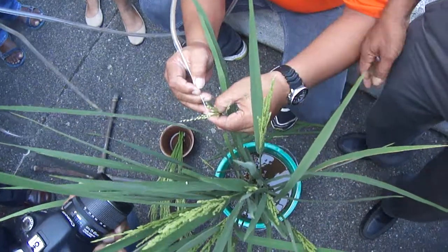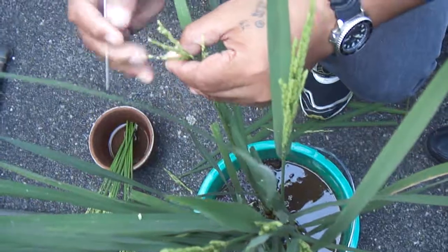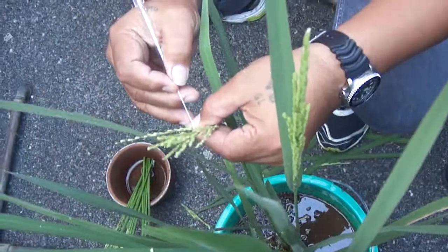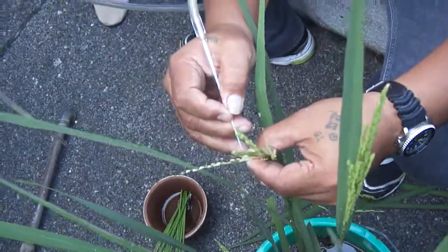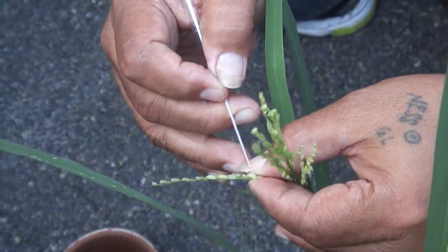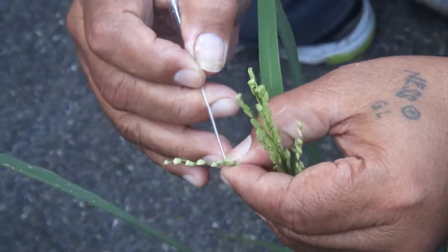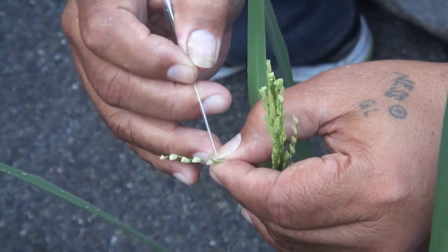The time is critical. You should do it in the afternoon, from 3 o'clock to 6 o'clock, because pollination occurs from 8 or 9 o'clock — depending on the variety — until 12 in the morning. So you should do it in the afternoon or very early in the morning, around 6 o'clock.